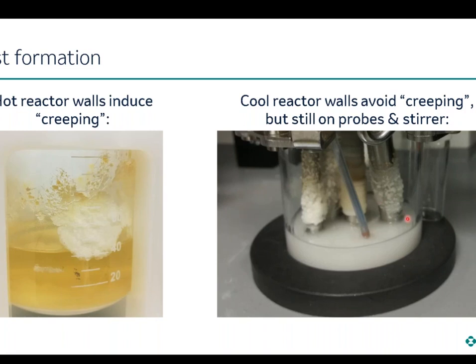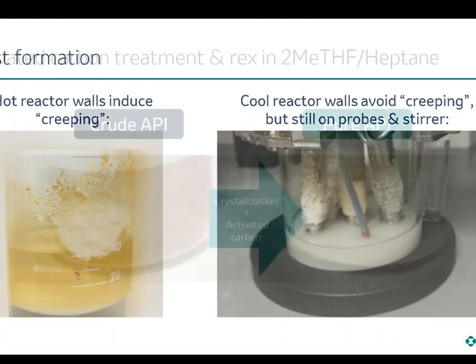However, at lab scale, I can mimic this and lift the reactor, so I have just a hot bottom heating. However, the steel probes show, as you see here, a similar effect. So the crusting is something that ideally we need to take out and work with either a glass lined or a Teflon lined reactor shaft, and then we can overcome this issue here. So much for the form. Form control then should be achievable.